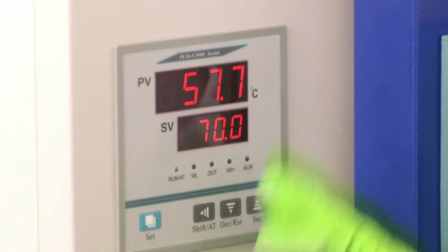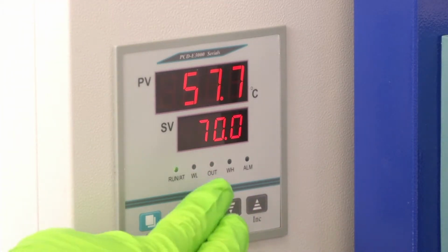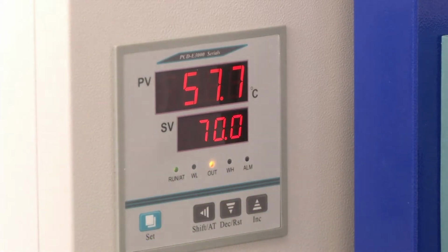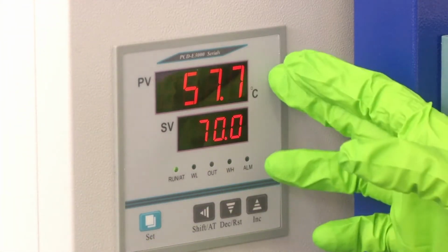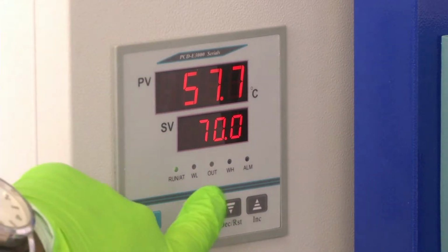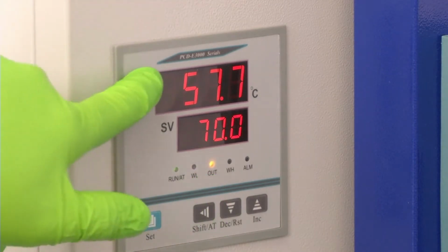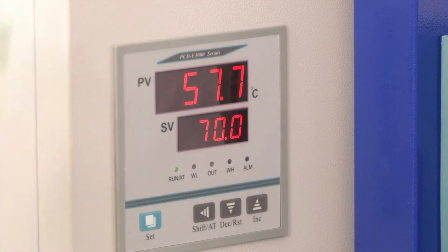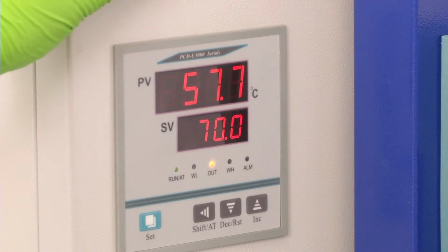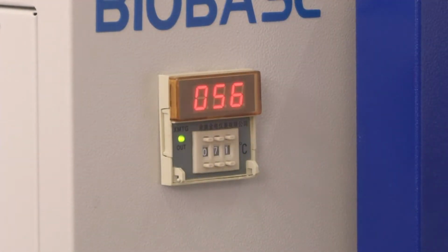Yes, now the set value is 70 degrees Celsius, and the equipment is running. Now it will slowly ramp up. Once it starts, the output signal will start going. It will slowly start ramping up to 70 degrees Celsius.